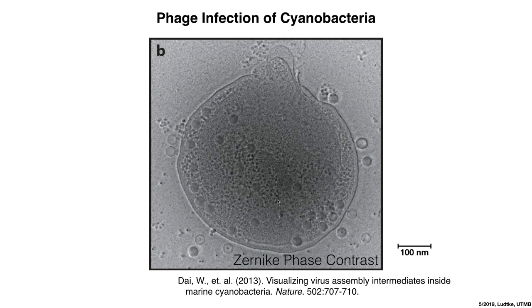The idea of what we'd like to be able to do is look at cells and get into them and say, pull out all the ribosomes and look at the structure of the ribosomes as they exist inside the cell. Or look at the organization, how the ribosomes are clustering in different ways inside the cell, along with having structural information. So it's not just localization. It's true structure.